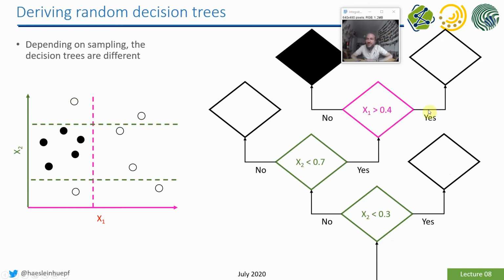And in the final case, we add another threshold on x1, which is on this axis here. It allows us to build up several decisions, these nodes, into a decision tree, which finally allows us to classify all the objects correctly in this sample set of our original set. If we have many of these trees making the decision together, for example in a democratic way, we are talking about a random forest.